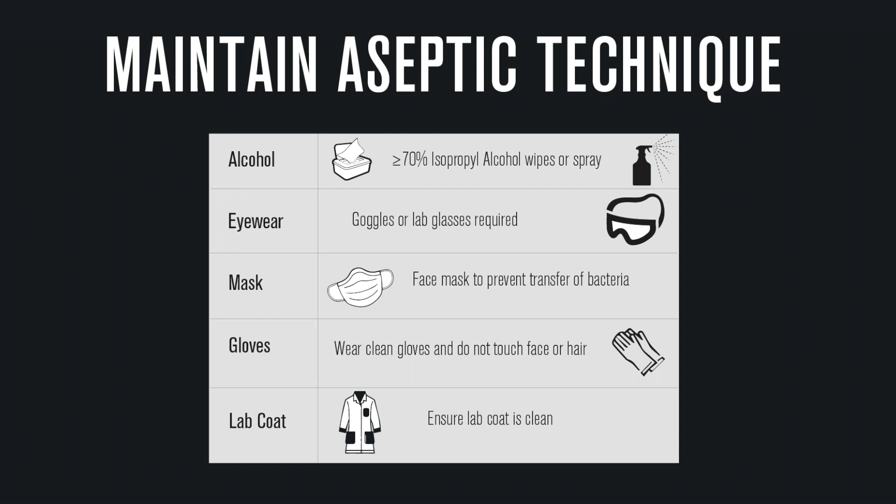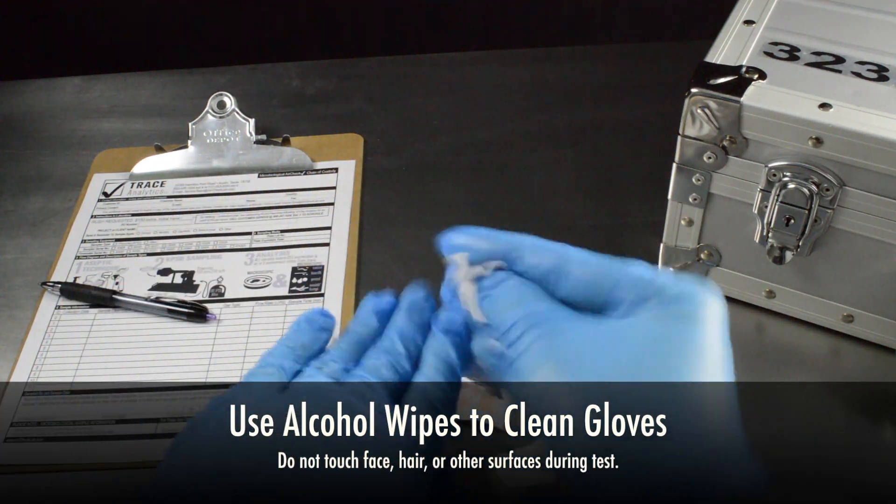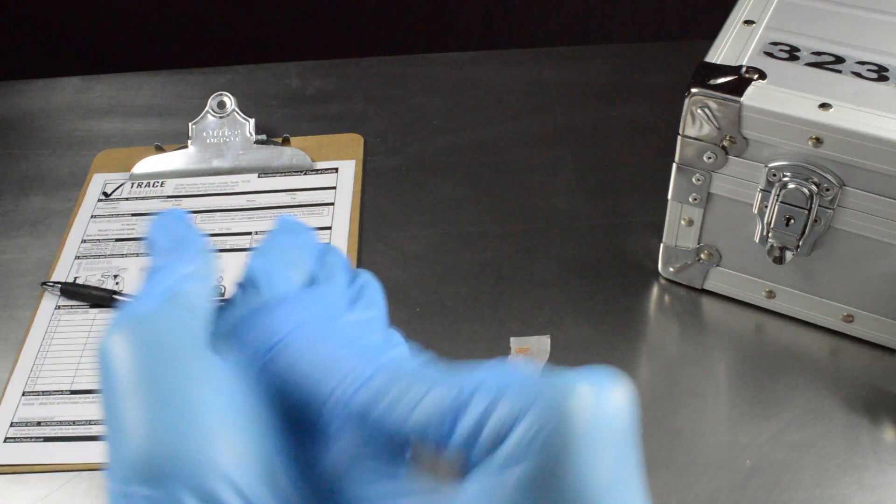Keep in mind that once your gloves are on, you will need to refrain from touching your face or other surfaces not pertaining to the sampling equipment. It is important to stay focused on maintaining aseptic technique throughout the duration of your test. If you do touch another surface with your gloves, make sure that you replace them or use alcohol wipes to prevent contamination.